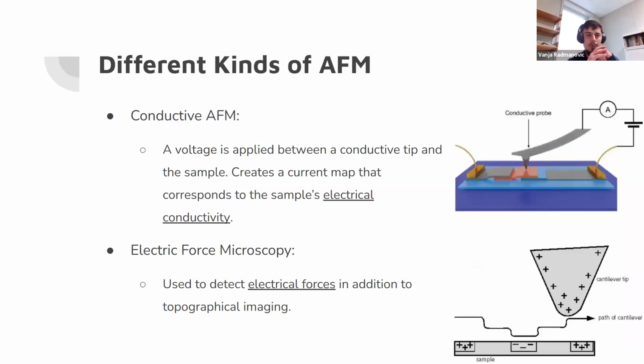And even though the method of AFM I was using for my project was the non-contact mode, as I discussed earlier, I'm going to quickly go over different versions of AFM you can use. There are different variations that have different purposes. I'm going to quickly go over how they work and their basic applications.